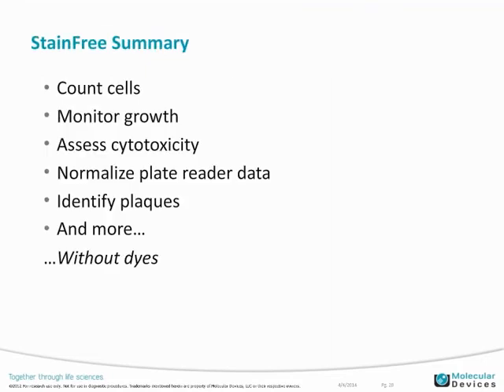To summarize, I've shown you a variety of ways that we can use the stain-free technology, including cell counting, monitoring growth curves, assessing cytotoxicity, normalizing plate reader data, and identifying viral plaques, all without the use of dyes.